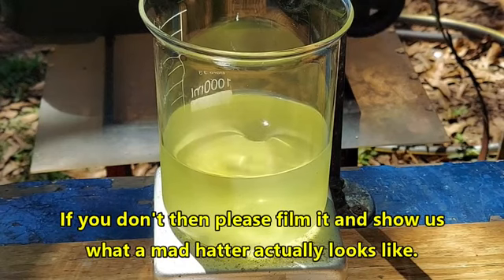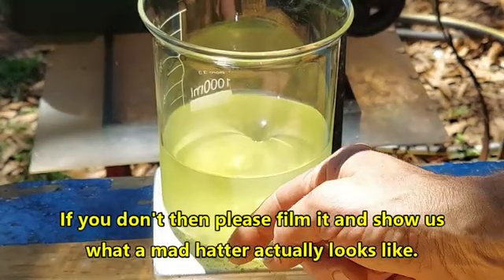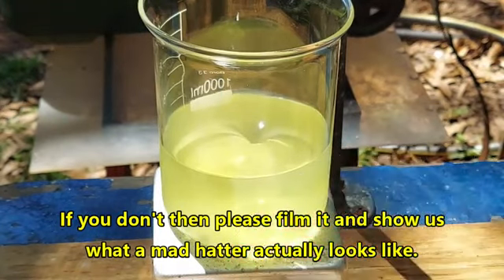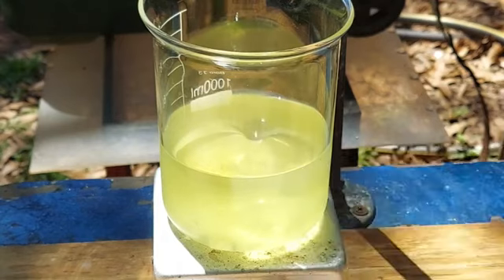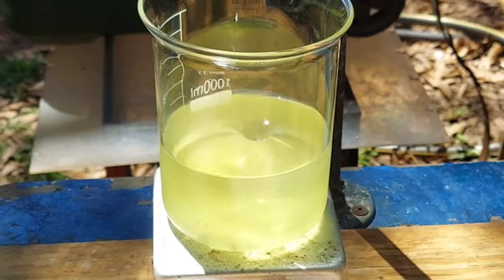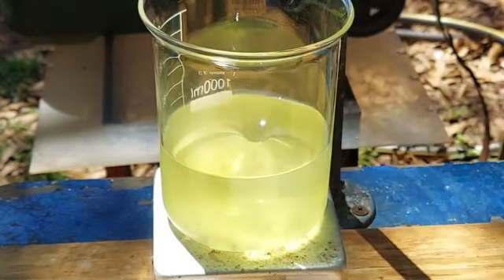So we are going to mitigate this by doing this when it is at a cool temperature. It's below the air temperature, so, being the middle of August, it's pretty hot out here. But this stuff is cool to the touch, so it's not super hot or anything. We've got it stirring. We've got it in a tall walled vessel that will hopefully catch most of the droplets. And we're only going to use a little bit of borohydride at a time.